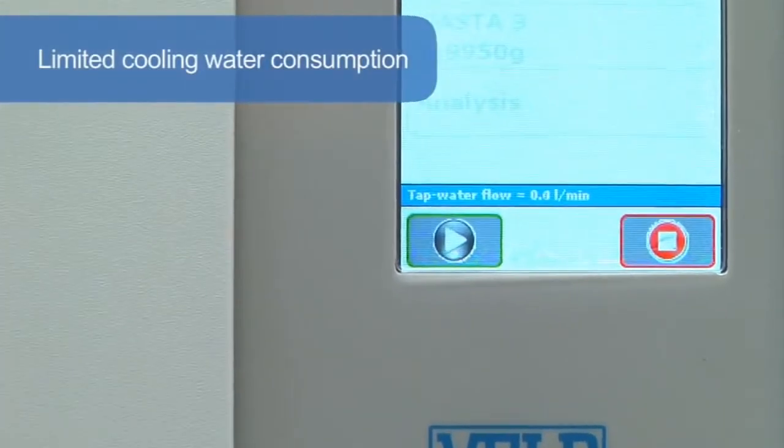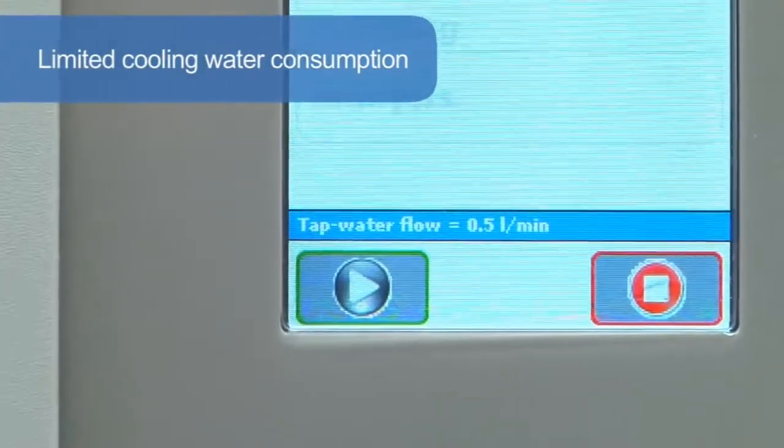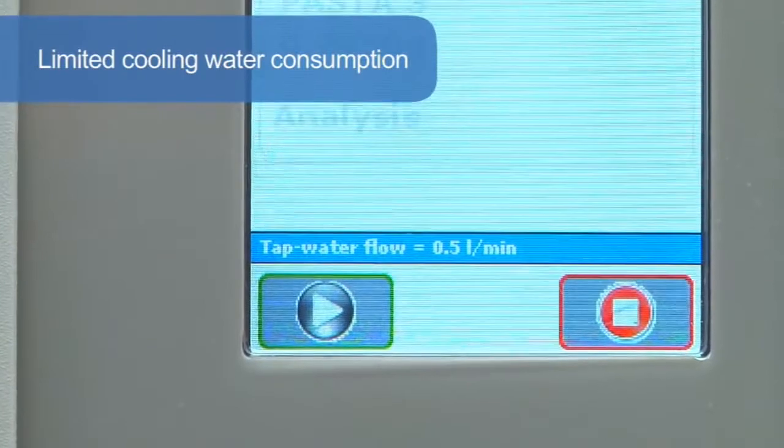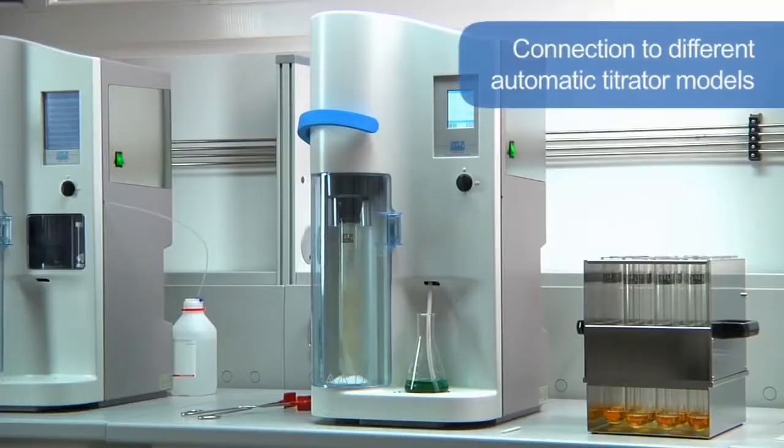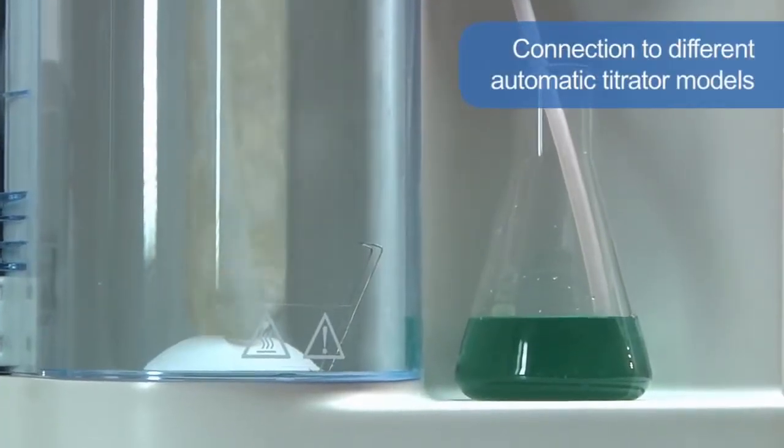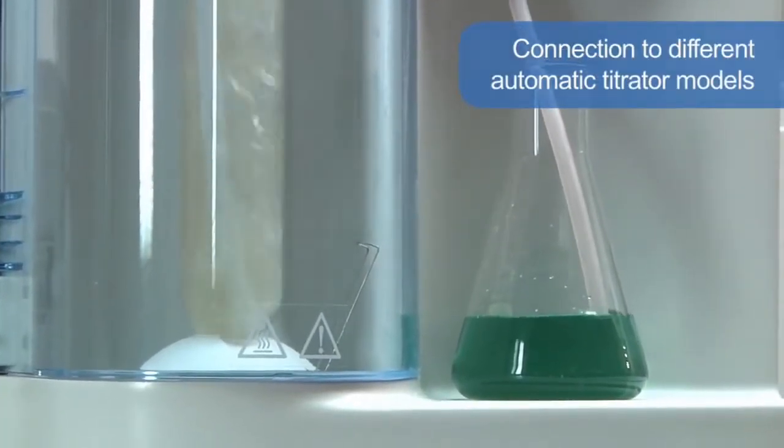In addition, the cooling water consumption is really low, starting from only 0.5 litres per minute. The UDK 149 offers connection to different automatic titrator models and enables the final result to be obtained directly.